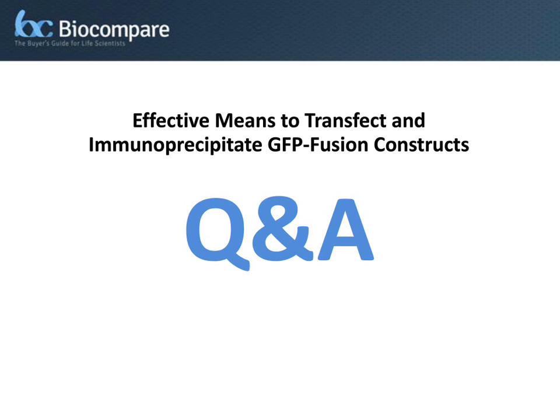Right, so this is a very context-specific issue. It depends a lot on the accessibility of the cells and what state they reside in. Electroporation works extremely well when you're dealing with an epithelium, and fortuitously, most mesenchymal cell populations in the embryo have an epithelial origin. The time frame over which you can do an electroporation depends to some extent on the proliferation rates of the cells.